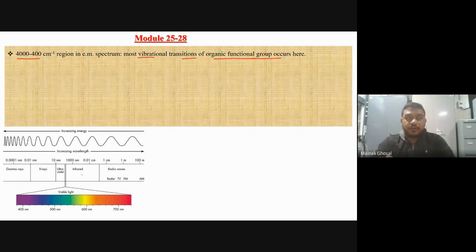If you illuminate any organic moiety with electromagnetic radiation of infrared frequency, you will see that different functional groups absorb this infrared radiation differently. I don't know whether you know about absorption or the Lambert-Beer law; I think I talked about it in the very first lecture.